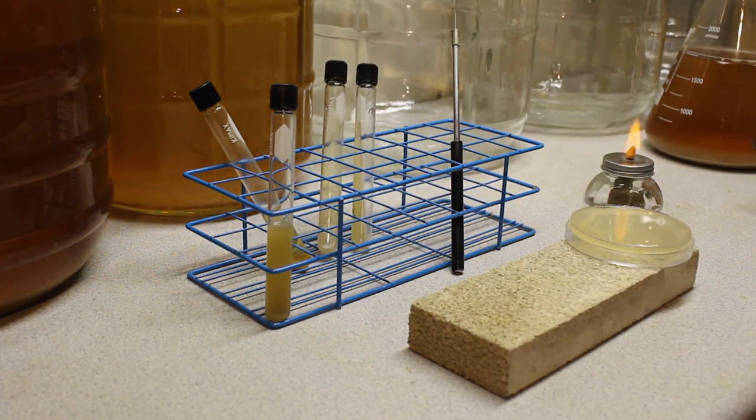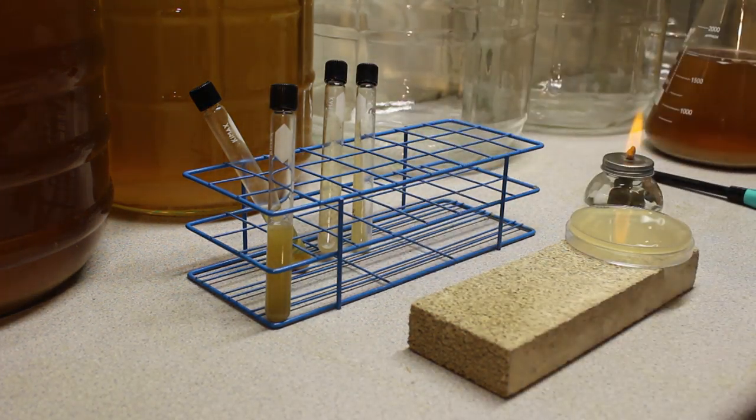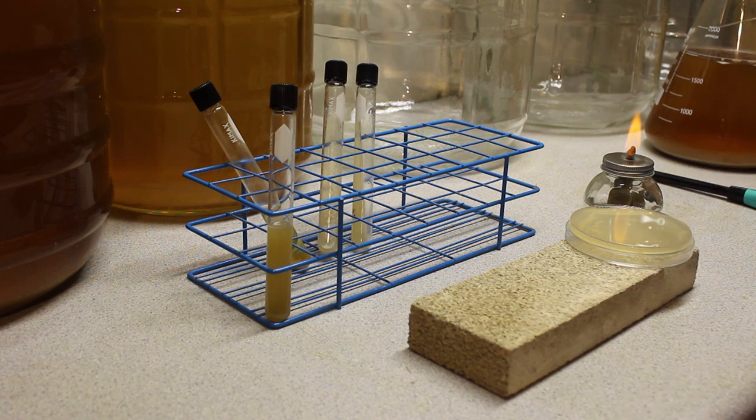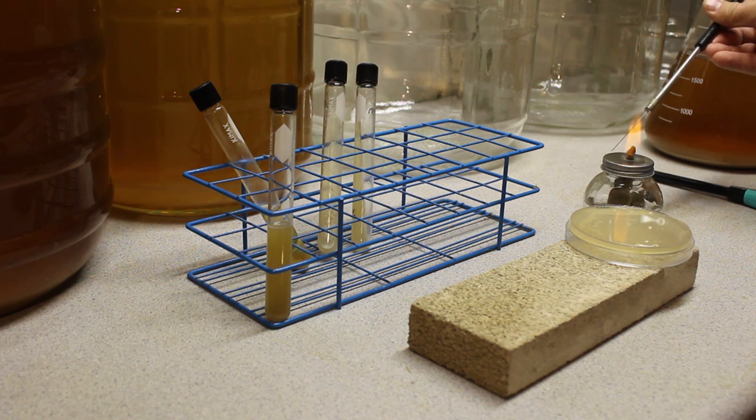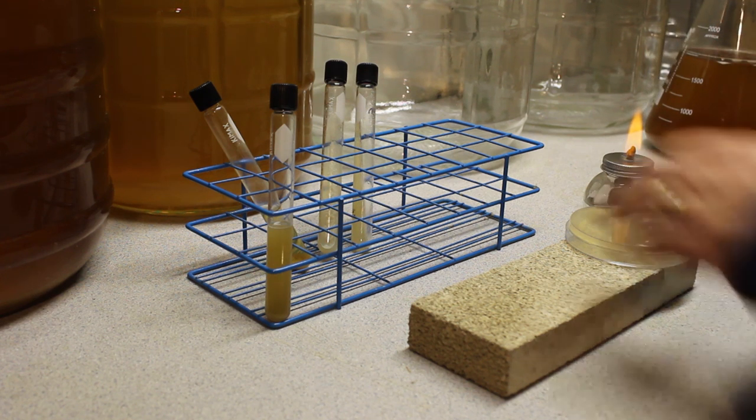So to start, what we want to do of course is light our lamp, and the first thing we need to do is to sterilize our loop. I show how to do this in my aseptic methods video, but basically you want to heat the entire length of that wire in the flame to red hot and that'll be sterile.